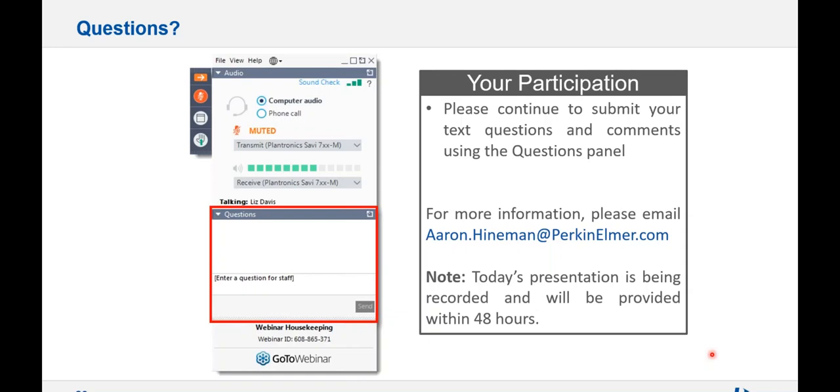From my experience, the tube life really depends on the sample type that you're using, so what's in the matrix, the dissolved solid content, etc. If they're very aggressive samples, you can get a couple hundred firings. It could be more if they're cleaner samples. So, what's your experience, Sarah?